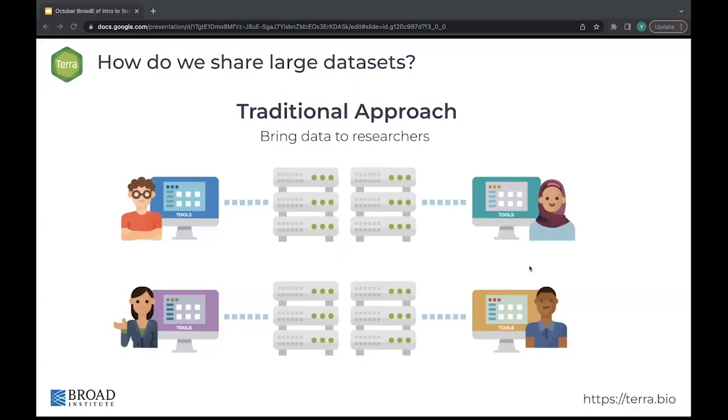So traditional bioinformatics looks like this. It's a central repository which holds all the data, and each researcher copies it to a local storage to analyze with their own analysis tools in their own custom computing environment. This approach has a couple of negatives, including instead of data sharing, we're doing data copying to local storage. There's high data storage costs since everyone is storing their own copy, and non-reproducible results because every analysis is done in an isolated environment using those custom tools we just mentioned.